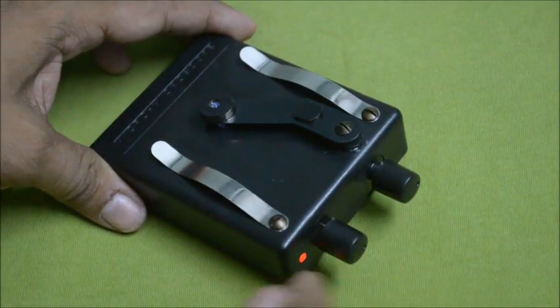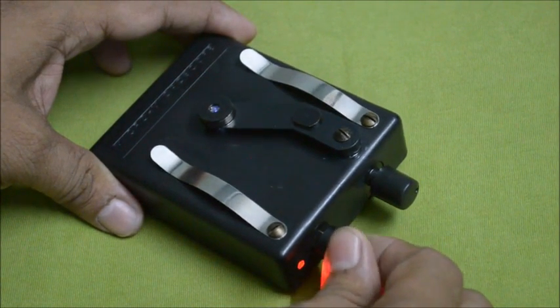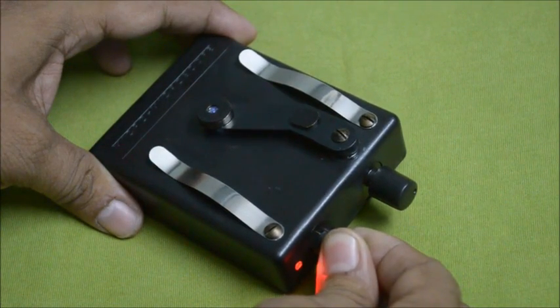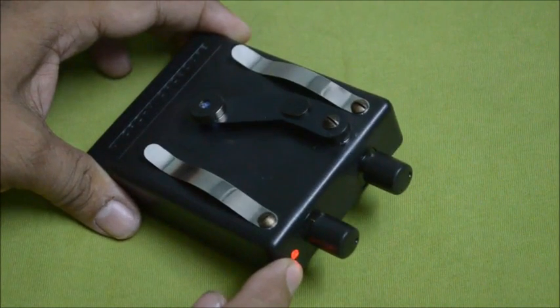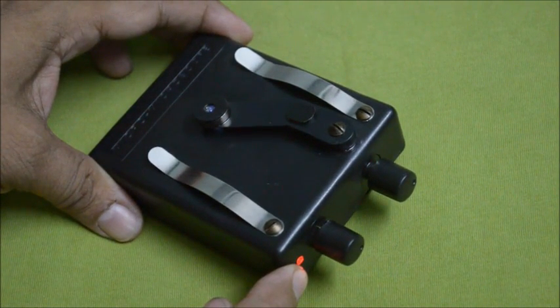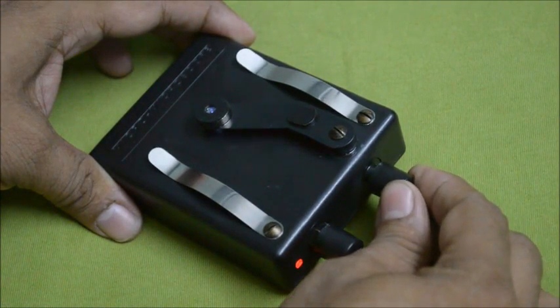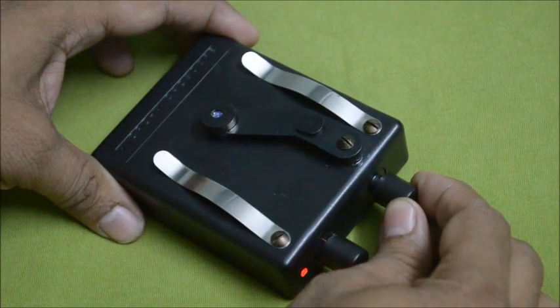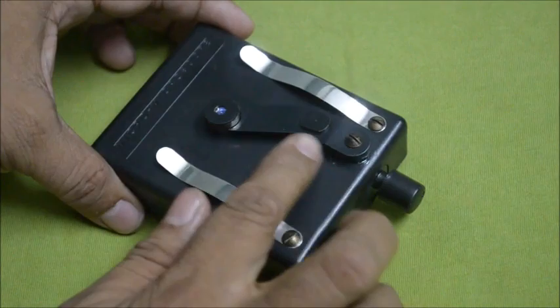There are two knobs. This one is the on/off switch combined with the brightness knob — you can increase the illumination through this knob and switch it on and off. When you switch it on, there is an indicator LED that shows the battery power. This one is the focusing knob; you can adjust the focusing as per your eyes.